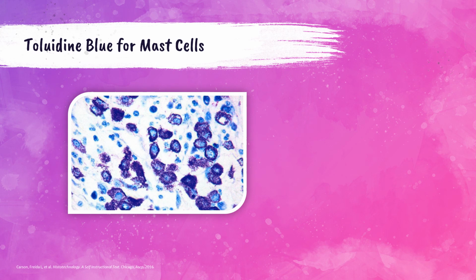This photo shows a skin section from a mastocytoma, actually from a canine patient. A mastocytoma is a tumor of mast cells and can occur in humans and other animals, like in this dog. This section shows metachromatically stained mast cells that are present.